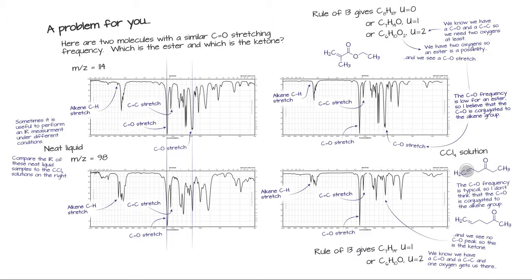So maybe it's this, maybe it's this. All you want to do is draw something that's not conjugated. And again, we'll turn to the NMR and that would settle the matter. So those are the actual compounds that I got from the spectral database. This is 5-hexen-2-one. So let's see, 1, 2, 3. Oh, not that one. 1, 2. There we go, 2-one. So there is 5-hexen-2-one.